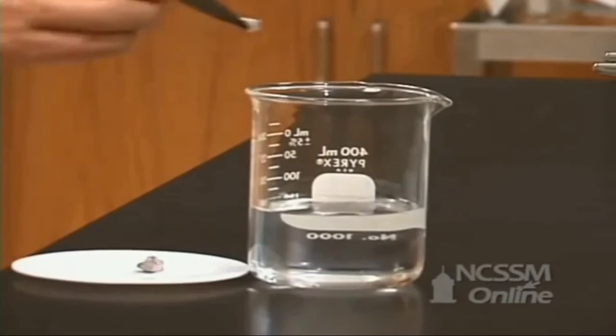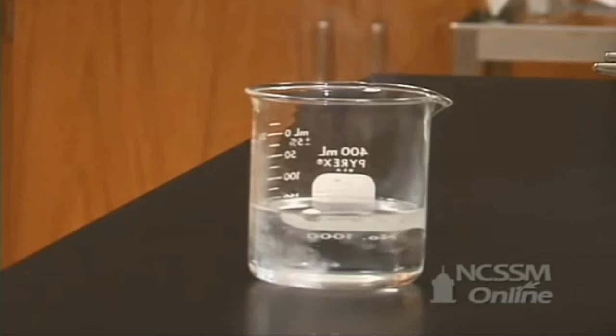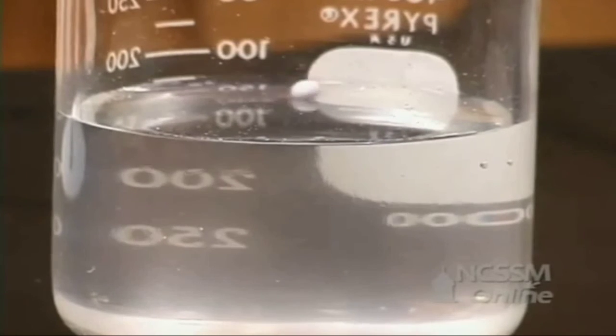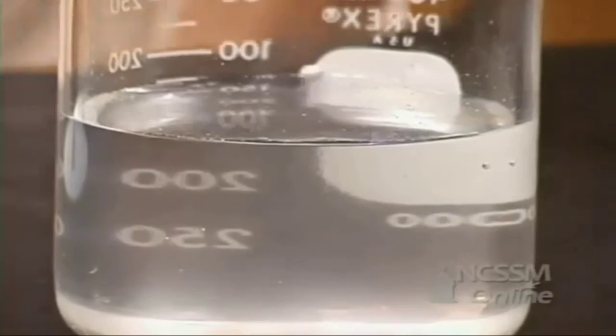If we take a piece of the sodium metal and add it to water, we notice a much more rapid reaction with the water. Like lithium, the sodium is less dense than water and floats. The metal moves across the surface, being pushed by the hydrogen gas that is produced.